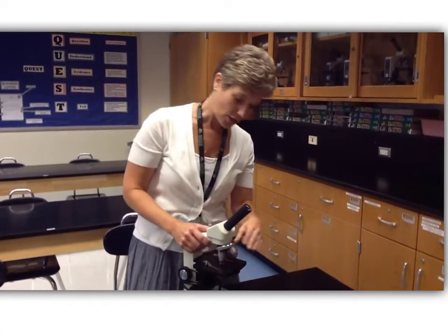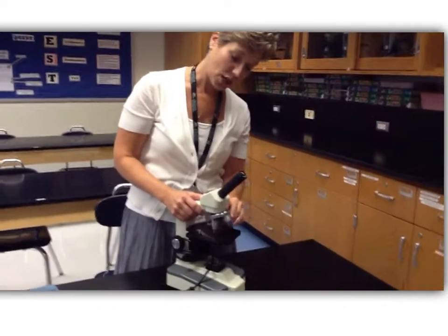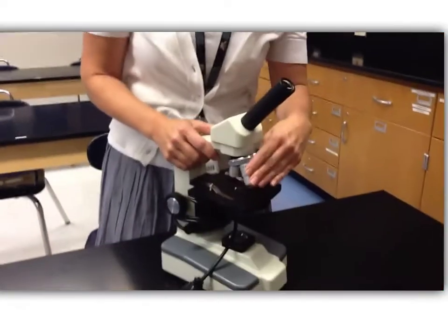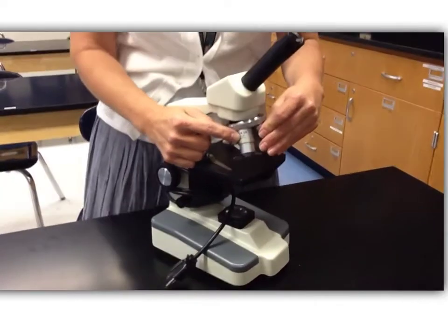They are also going to magnify. We can change the magnification by changing the lens, and you can see on the lens what the magnification is.